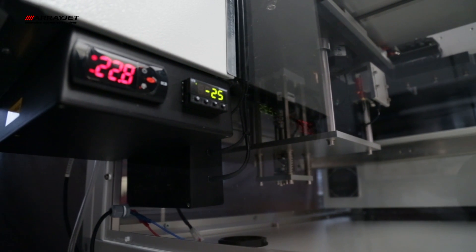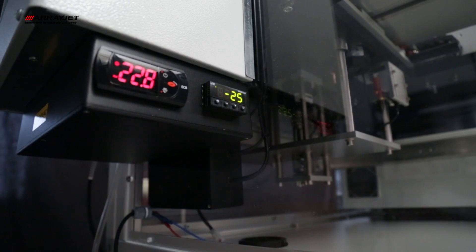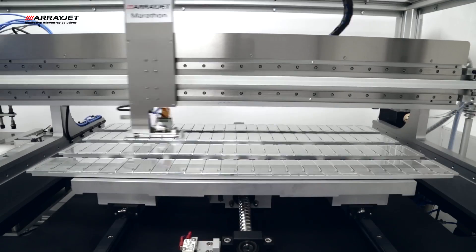ArrayJet's jetmosphere ensures complete temperature and humidity control throughout the printing process.